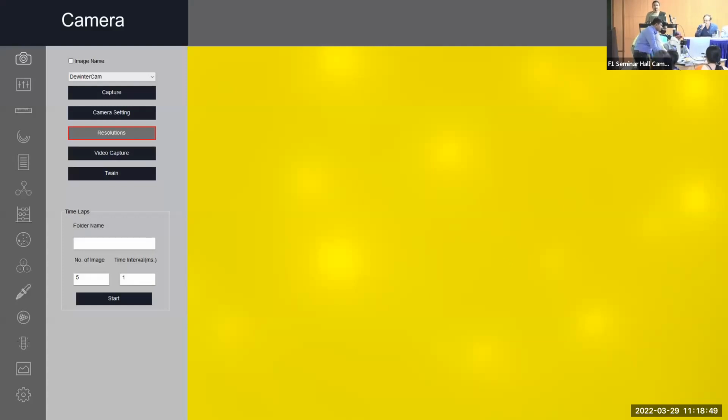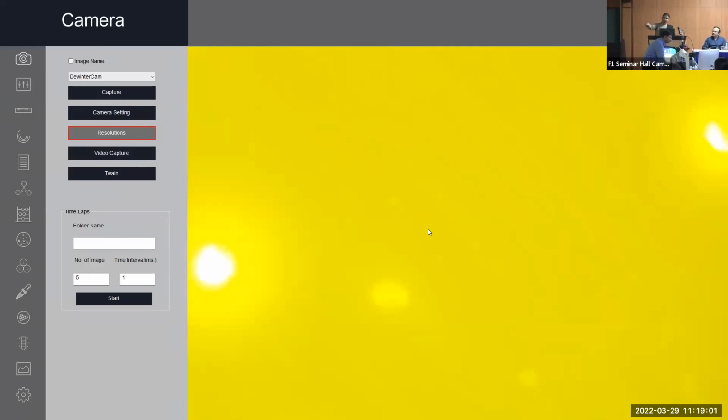So yeah, as you have seen in the presentation we made regarding the microscope, camera and image analyzing software. So here are our microscopes along with the camera. And this is the fluorescent microscope. So anybody interested can come and operate after the demonstration is done.